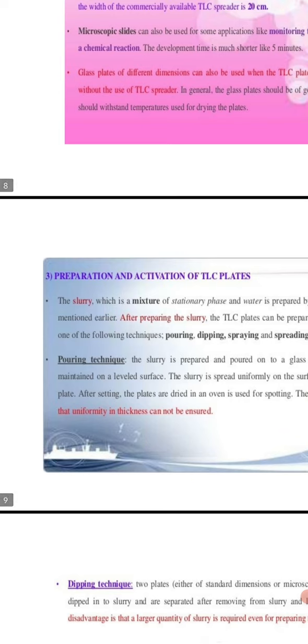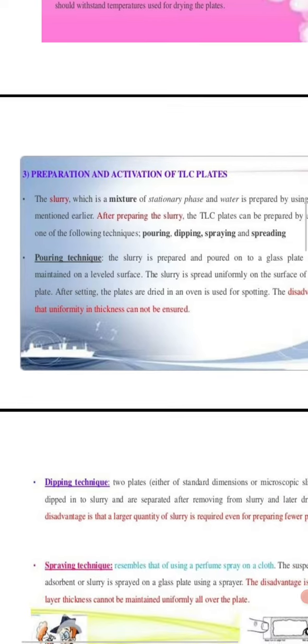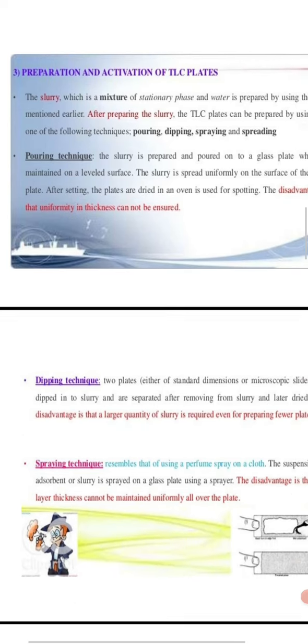हम generally pouring technique use करते हैं for the activations or the preparations of the TLC plates, but in this disadvantages इसका ये है कि हम इसकी uniformity as well as thickness को हम ensure नहीं कर सकते. So that is the disadvantages of this method.